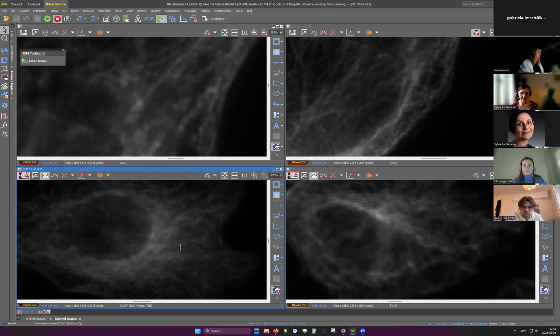Do you have a possibility to zoom in to the same cell, just so that we can compare? Unfortunately, the 60x cells are the same, but the other one not. I couldn't get back to exactly the same place. That was my plan, but something went wrong. I wanted to see if we could find any artifacts, but of course, you have to compare with the same cell, so unfortunately I didn't manage to do that. Only for 60x and for 20x comparing to each other, it worked out.